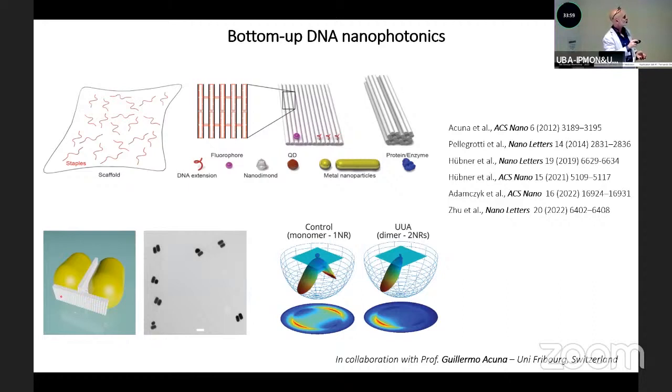Here you see in these transmission electron micrographs how they form. So these two rods separated by a small gap act as an optical antenna, just like these phased array antennas that were used for TV, you know, on the rooftops years back. This is a very simple design like that, just two elements.